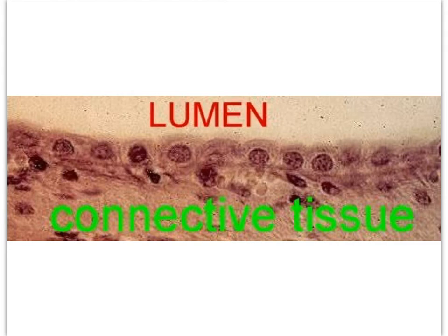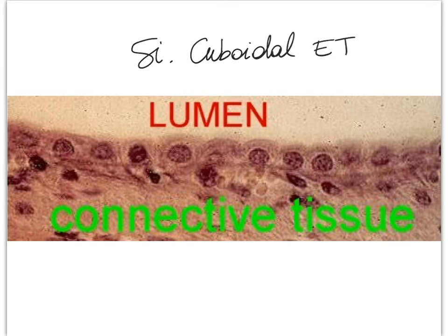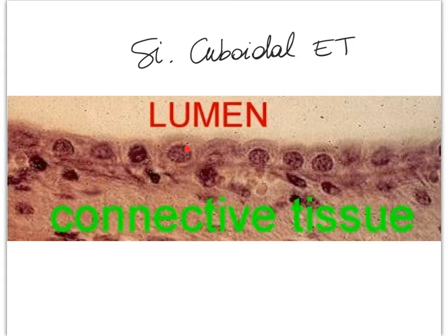Simple cuboidal epithelial tissue is one of the easiest tissues to recognize under a microscope. Here we see a generalized image — right here is the lumen, and remember the first tissue that always touches the lumen is our epithelial tissue. This single layer of cells with gigantic round nuclei is our simple cuboidal layer. Notice the spelling: cuboidal. These big round dark nuclei are very characteristic, and the single layer rests on connective tissue that is vascularized.